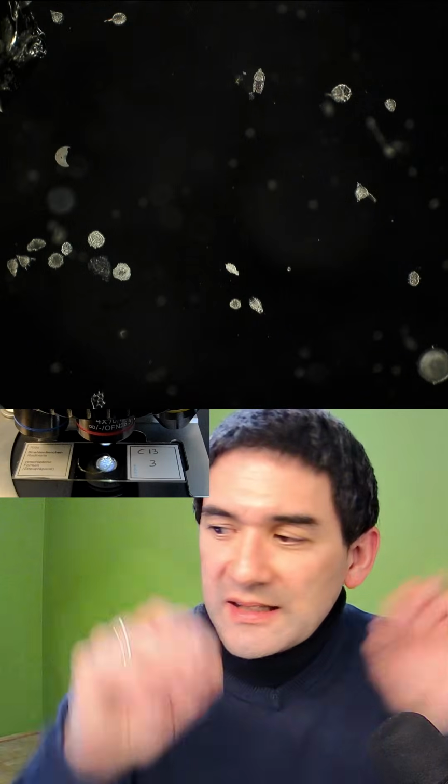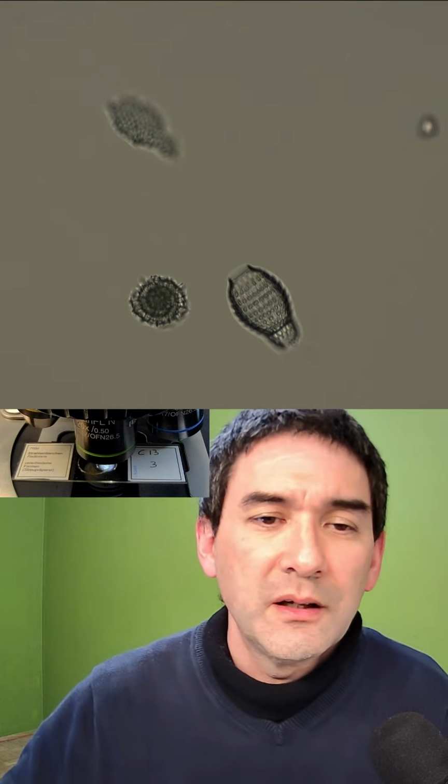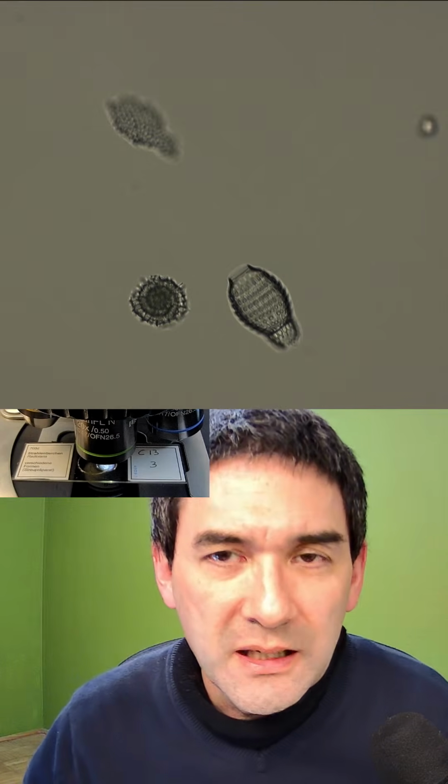Yes, they are amoeboid cells, and apparently those pseudopodia, those extensions, are able to extend out of the holes that you see there in the shell. I lost the focus again. But you see those tiny little holes in those shells. So they're quite nice. They're basically marine.